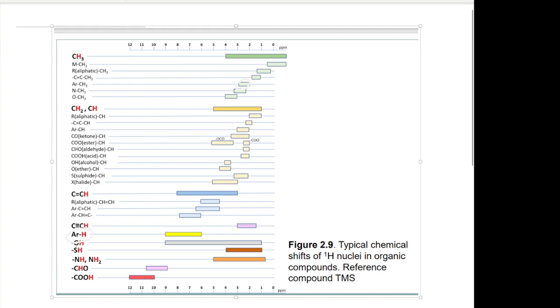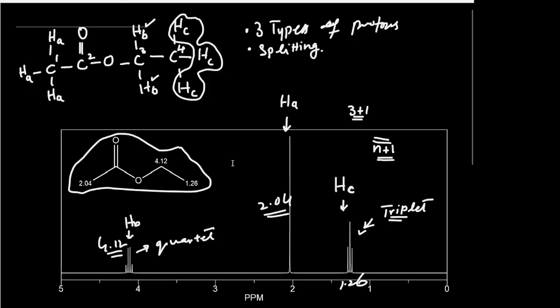The purpose of telling you about that is that there may be different scenarios, for example, when the compound is missing. When the spectrum is given and the compound is given, it is very easy for you to interpret the spectrum, because from the proton you can see the splitting. If the splitting is, for example, a quartet, this is only for the Hb type of proton, not for the Hc type of proton. So you quickly get the idea that this is for the Hb type of proton.